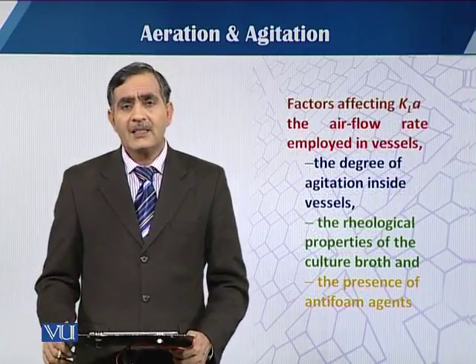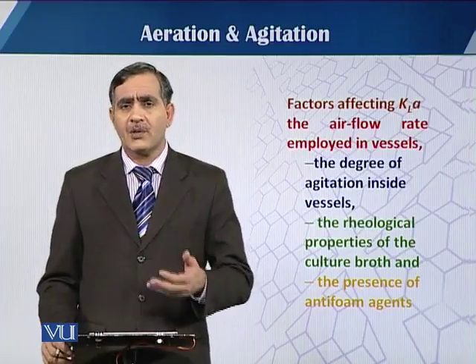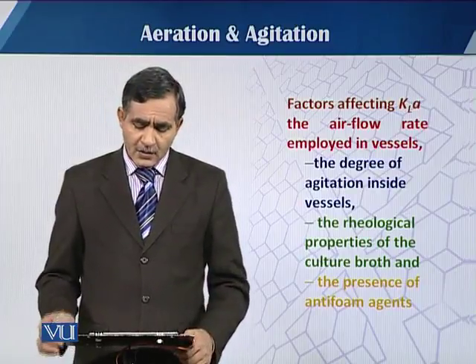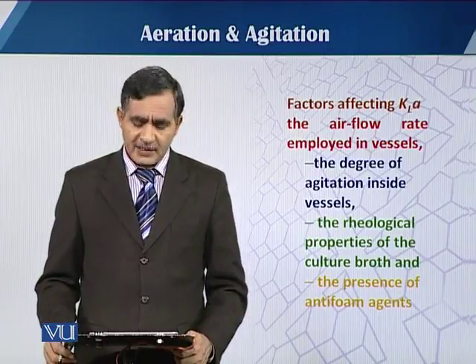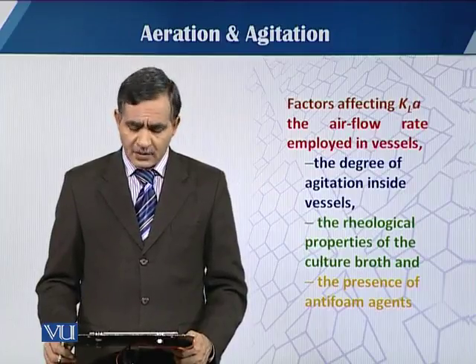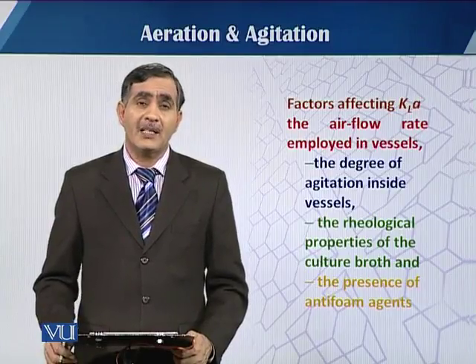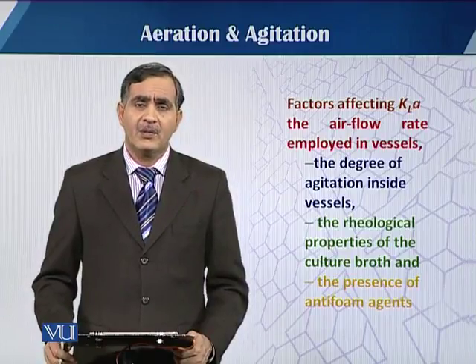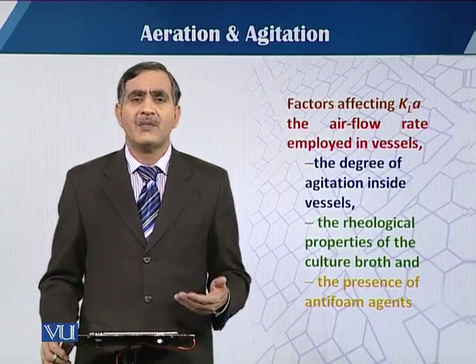As far as the KLa, the volumetric mass transfer coefficient, is concerned, a number of factors affect KLa. You can see here that three major factors are involved: the degree of agitation inside, the rheological properties of the culture broth, and the presence of antifoam agent, because antifoam agents have an adverse effect on oxygen solubility. So these are the different factors that affect the estimation of KLa.